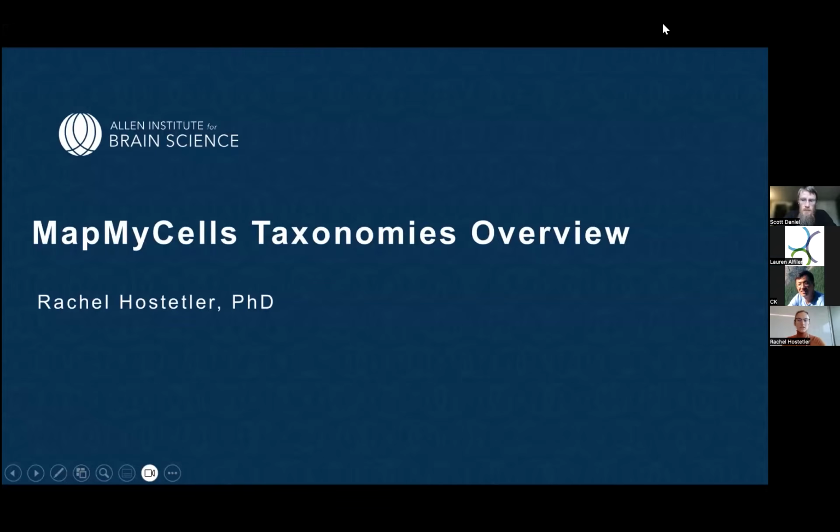Hi, everyone. I'm Rachel, and I'm going to be going over a few of the reference taxonomies that are available in MapMyCells, and also just what a reference taxonomy is. If you've attended some of our previous webinars, you know that at the Allen Institute, there have been multiple very large taxonomies generated over the past few years. The whole mouse brain one is our most recent mouse work. We've gone into some detail in previous webinars about how those taxonomies were made, but today I'm just going to describe what types of cells exactly are available in that taxonomy.